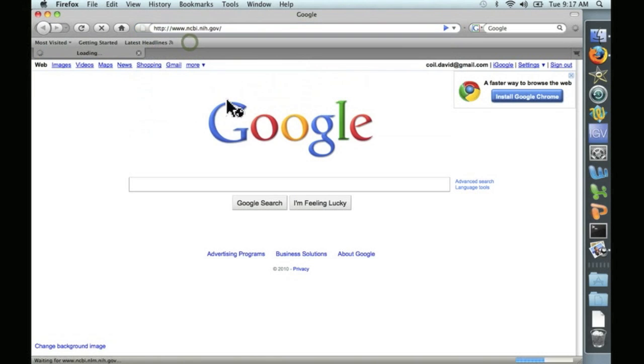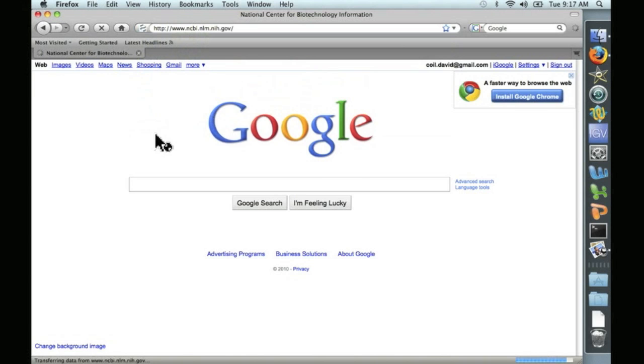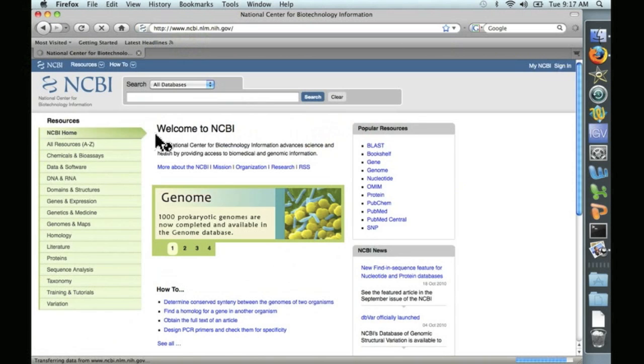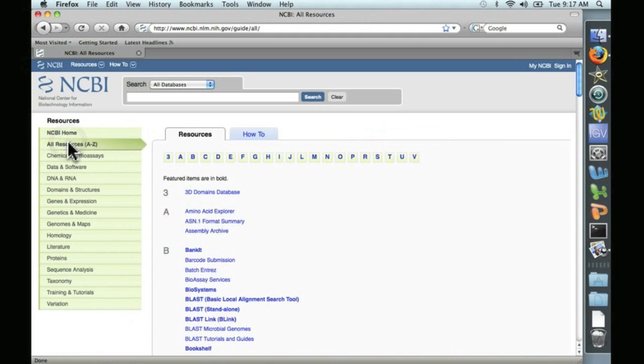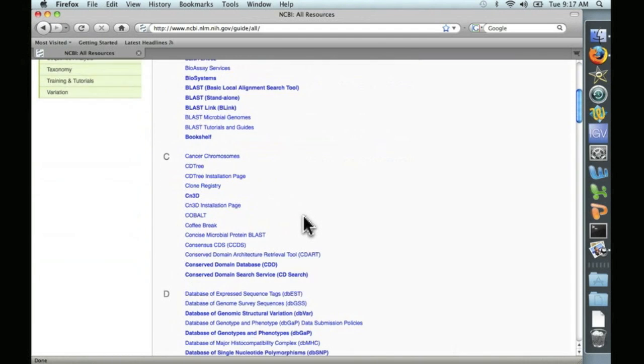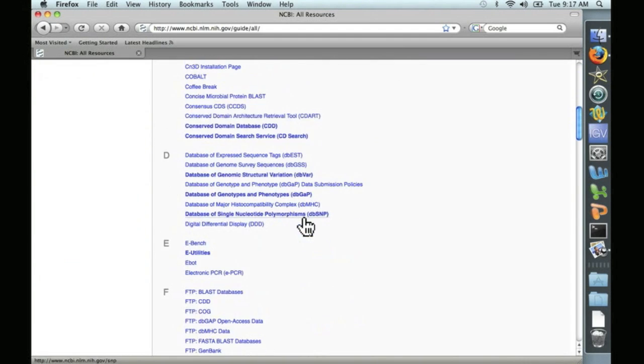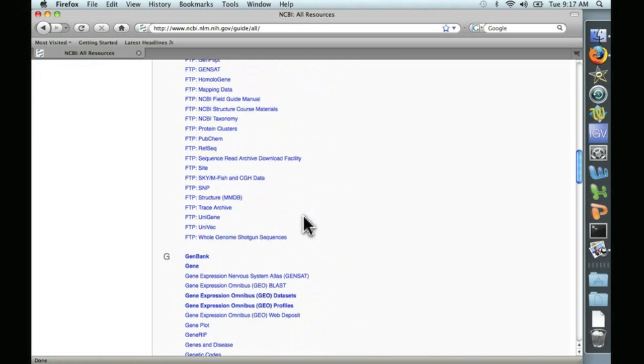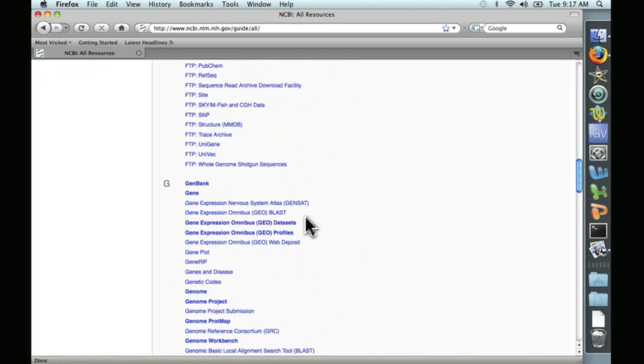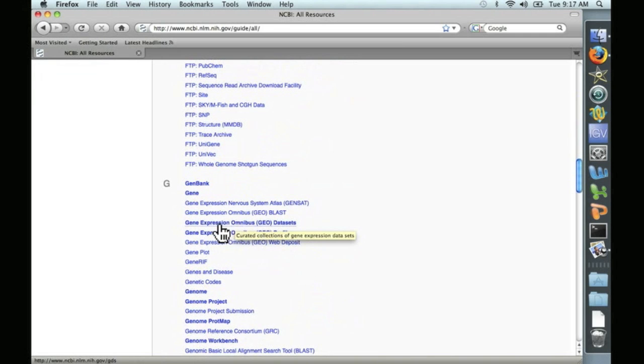Pull up NCBI here. And we're interested in all resources, and we're looking for the GEO database, the Gene Expression Omnibus database. So we'll scroll down, and there it is, Gene Expression Omnibus GEO data sets. Let's click on that.